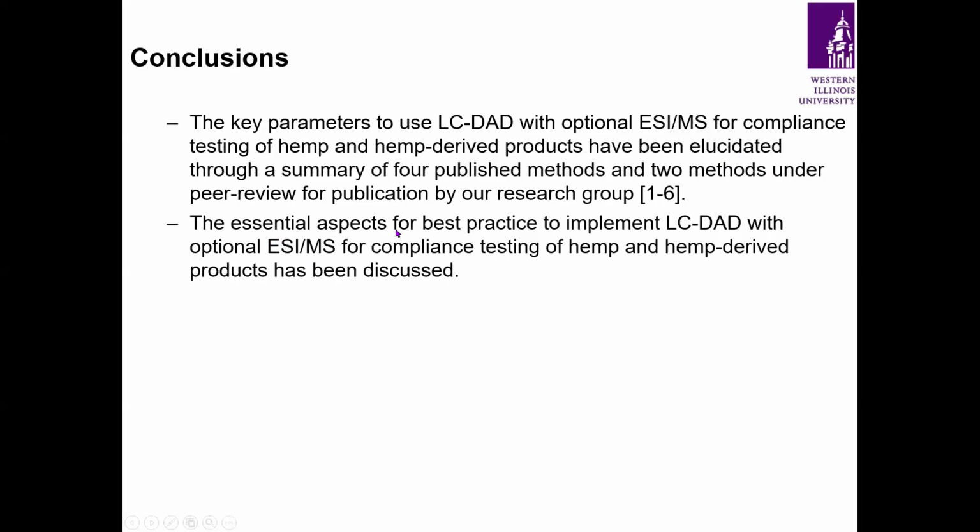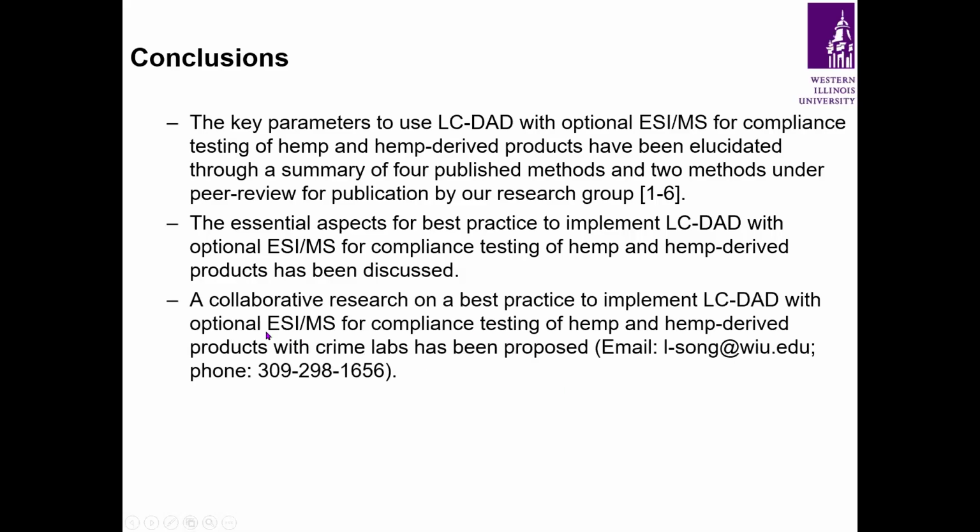The essential aspects for best practice to implement LC-DAD with optional ESI-MS for compliance testing of hemp and hemp-derived products have been discussed. Collaborative research on best practice to implement LC-DAD with optional ESI-MS for compliance testing of hemp and hemp-derived products with crime labs has been proposed.